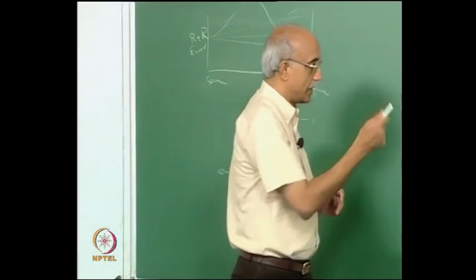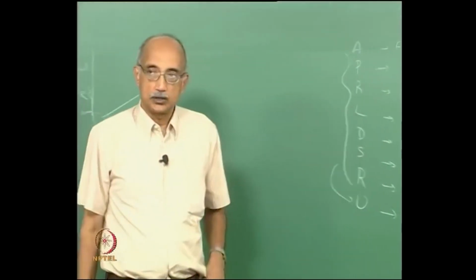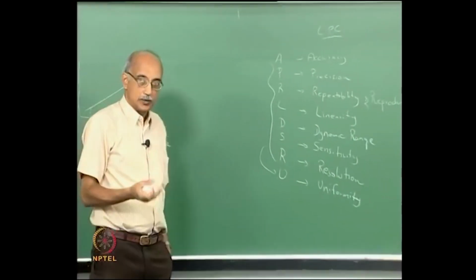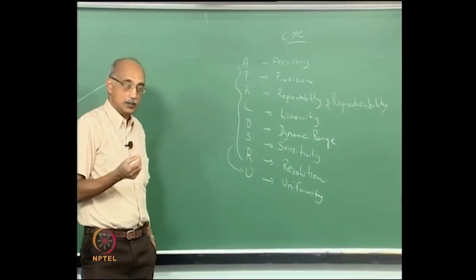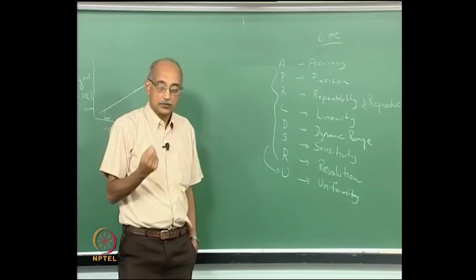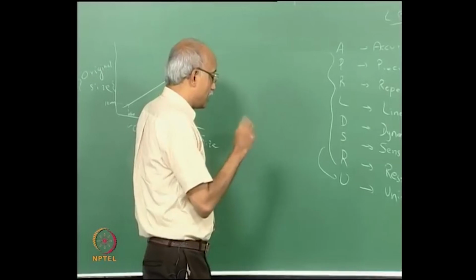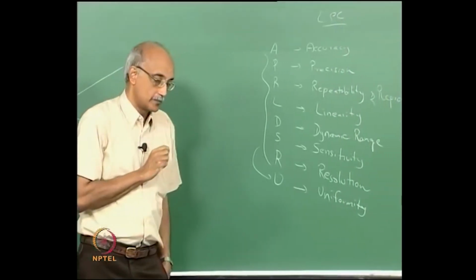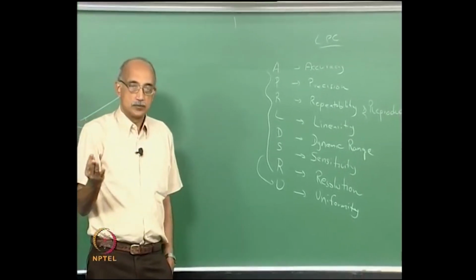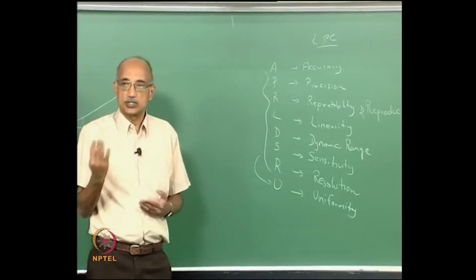Okay, so going back, given that all these characteristics have to be satisfied in a particle counter, it is clear that the quality of the data you obtain from a particle counter very much depends on how well controlled, how well characterized and how well calibrated the operation of the instrument is. Calibration is a very important step because it makes the bridge between data that you obtain from your instrument and something that is traceable to an absolute standard.